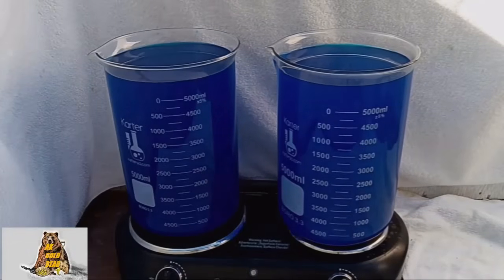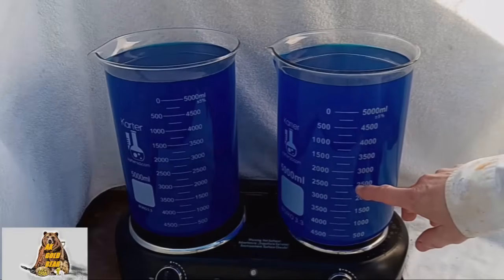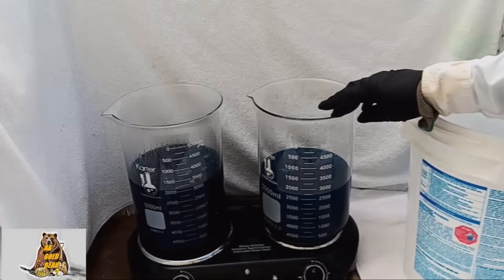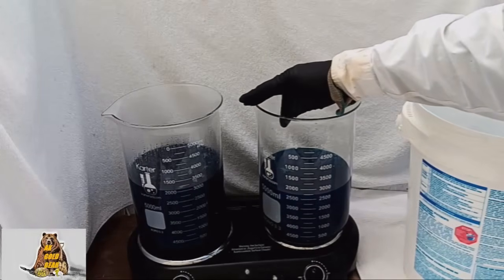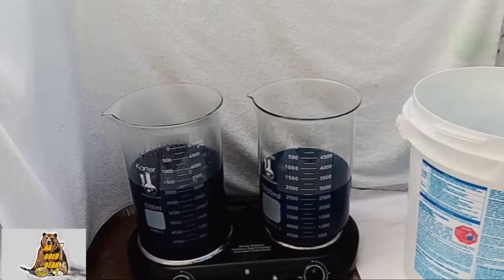I'm going to evaporate half of the water from this solution. I want to evaporate 3000 milliliters of water in each beaker. A slow process — I spent 5 hours on this. Now the density of copper nitrate in the beakers is very high.